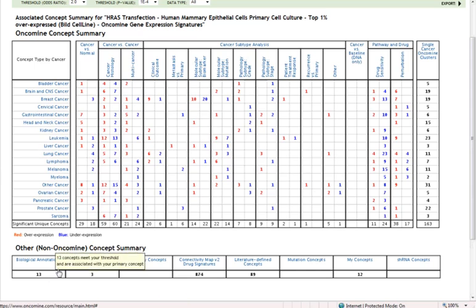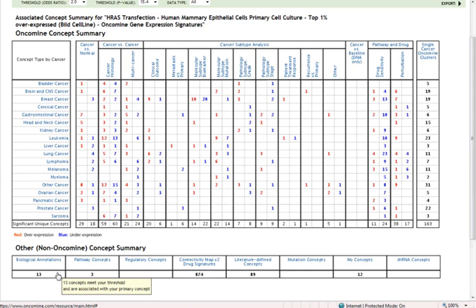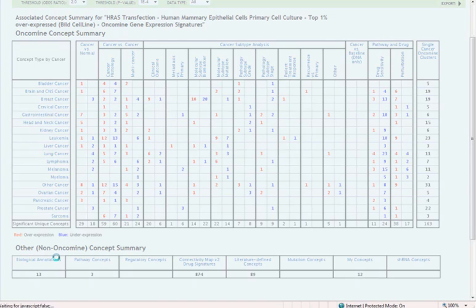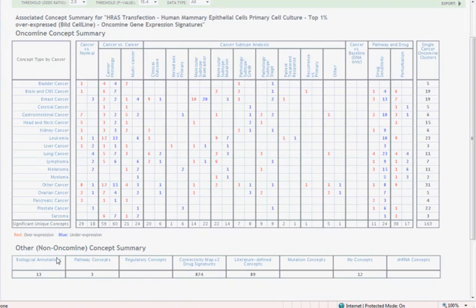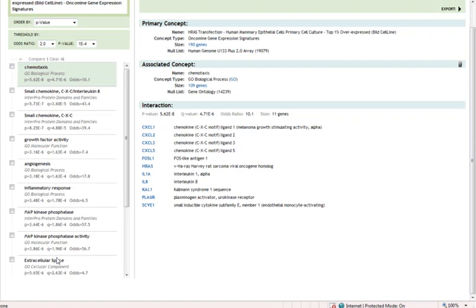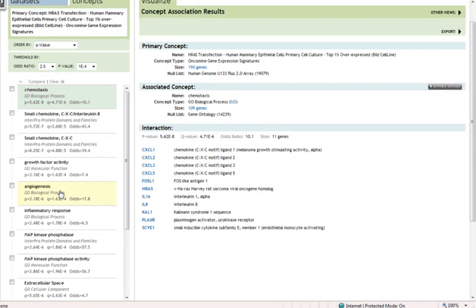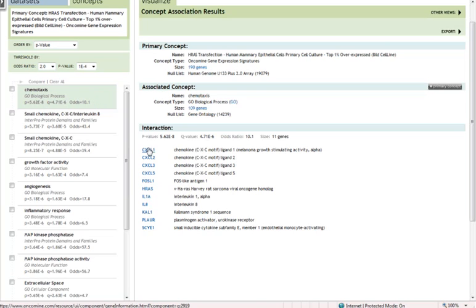For example, we have 13 biological annotations that are associated with this RAS signature. We can simply click on that to see what those associations are. For example, we have this strong hit between RAS pathway activation and chemotaxis genes.